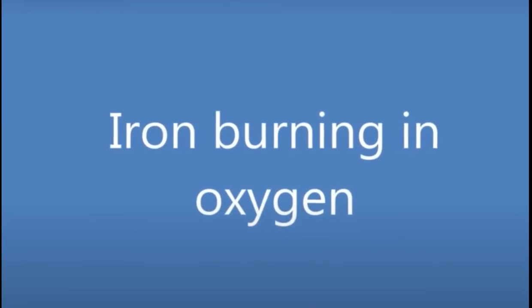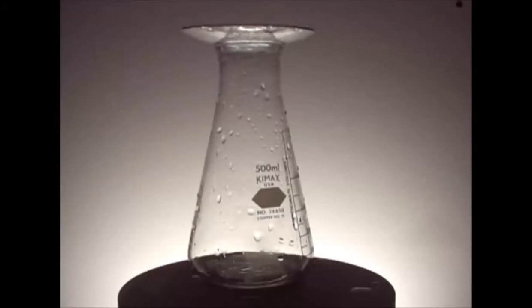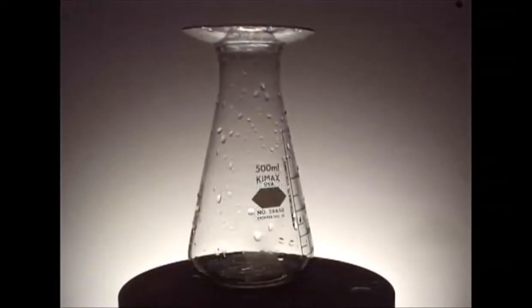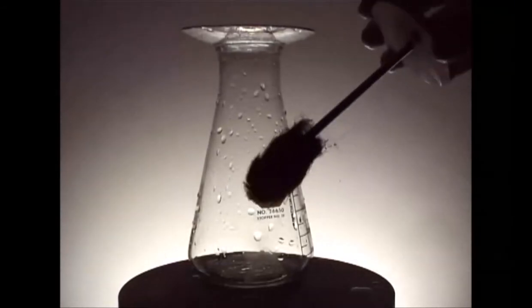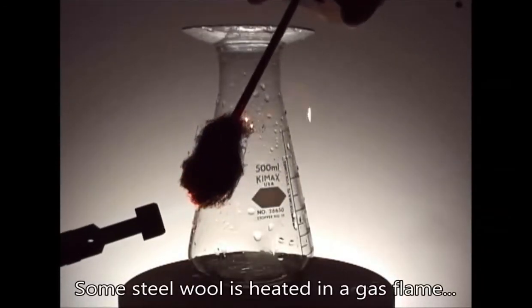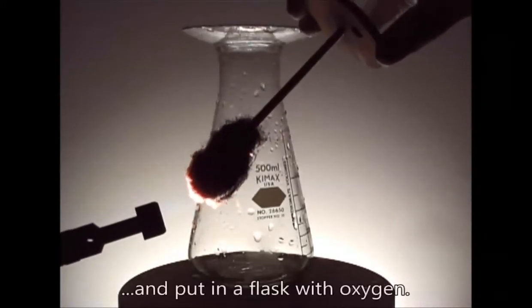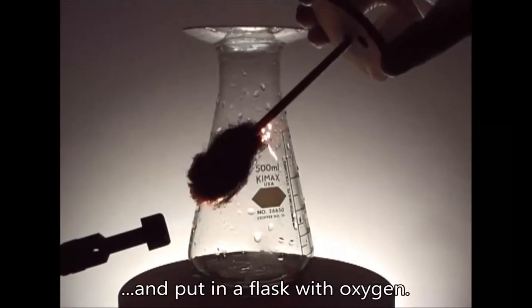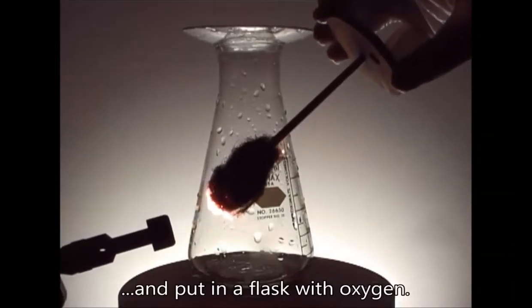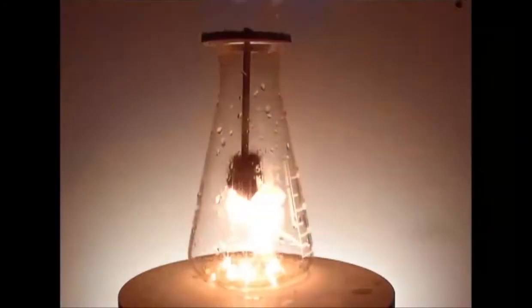This is the reaction with iron burning in oxygen. What we're going to do is take a piece of steel wool and heat it up, and put it into an Erlenmeyer flask that contains pure 100% oxygen. Steel wool is made up primarily of iron. So we're just going to heat that up to initiate the reaction and put it in.